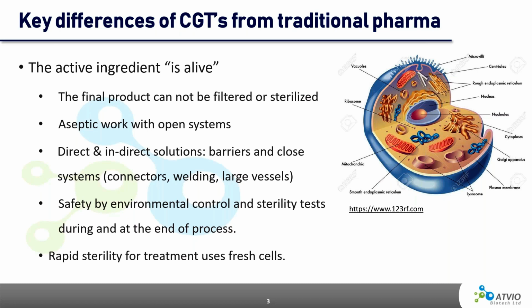which means, if you imagine a regular cell therapy process, a lot of open manipulation, because when we passage the cells from flask to flask, we open caps of flasks, bottles, and tubes, and handle liquid between them via pipetting, which is very open manipulation and prone to contamination. Even very small movements can cause turbulence just next to the product, which will eventually cause contamination.